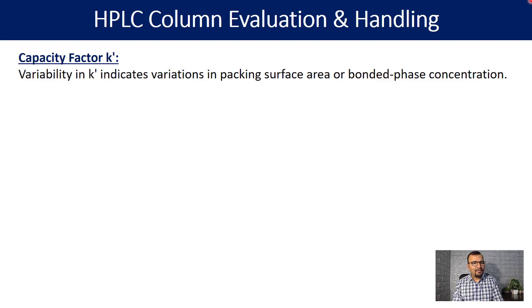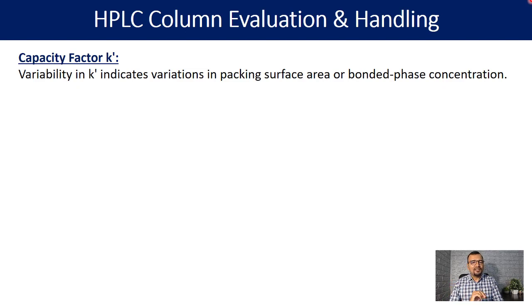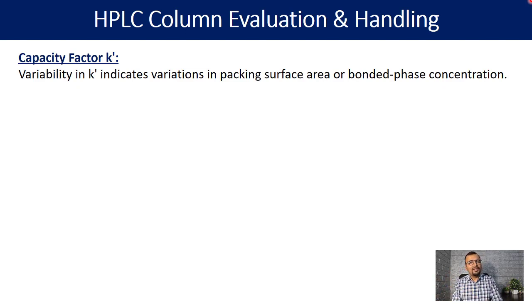The capacity factor — variability in k' — indicates variations in packing surface area or bonded phase concentration. Sometimes if your pH is very extreme, your silica may get dissolved, and because of that your bonded phase concentration can decrease. With less stationary phase available, there is less interaction, resulting in a reduction in k' or retention time. So variability in retention time or k' indicates that your packing surface area is getting reduced.